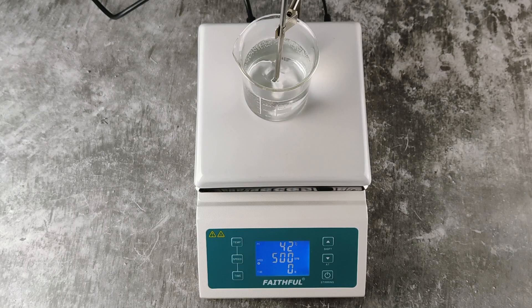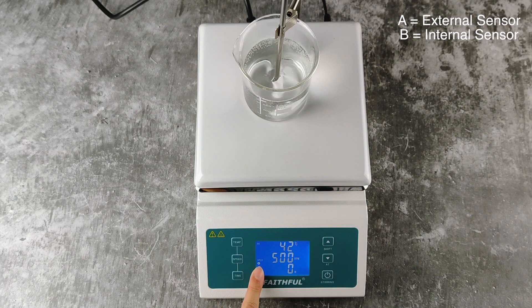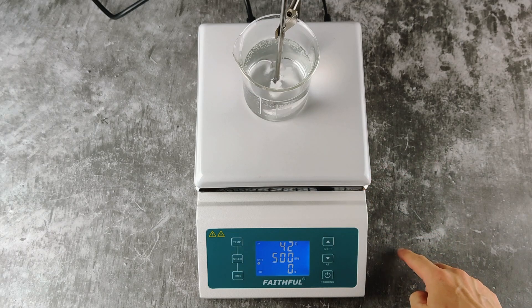This hot plate stirrer has two sensors: an internal and external sensor. You can swap between the two. The external sensor is indicated by the alphabet A here, and if I change it to the internal sensor, it will be shown as the alphabet B.